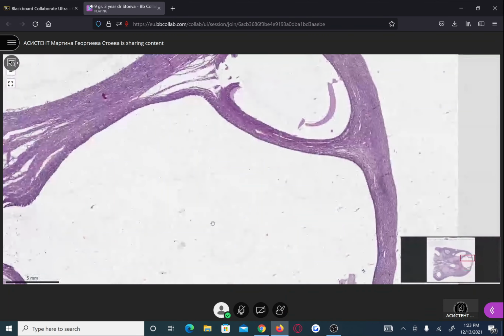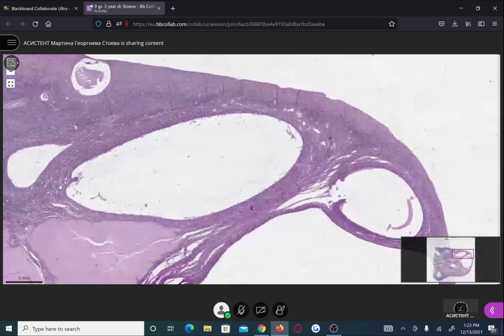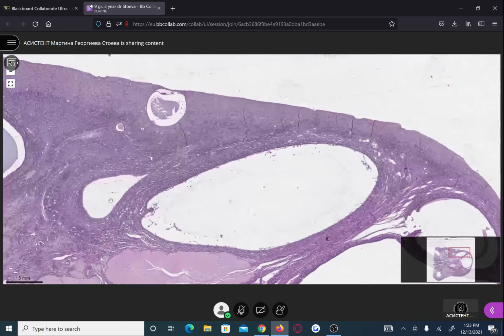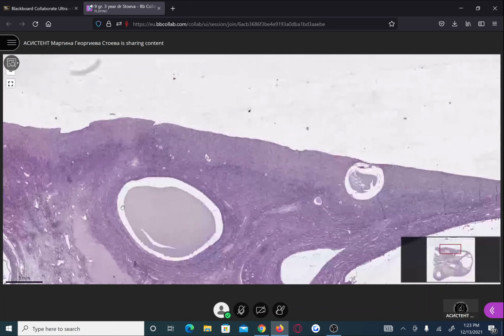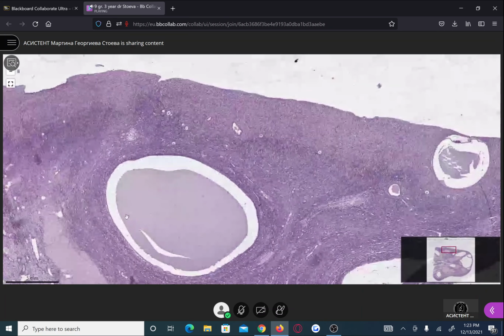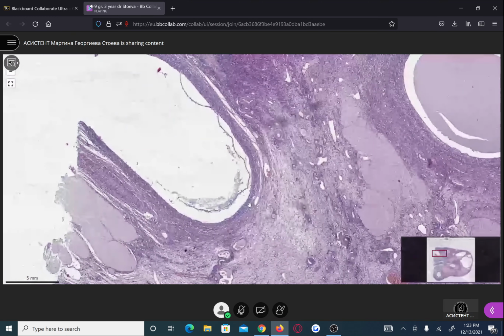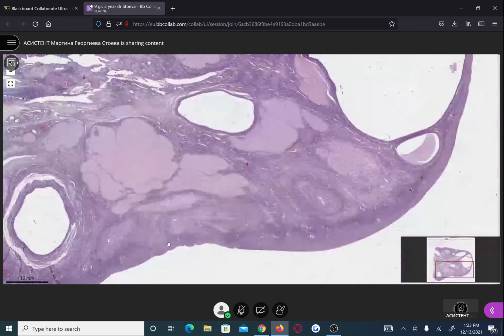You know that there should be an area within the follicle where we can find the oocyte, but because of the large size of the follicles, the cut section could be not through the area with the oocyte. Normally there is such a zone which contains the oocyte. Especially in our slide, I can't find such a zone.